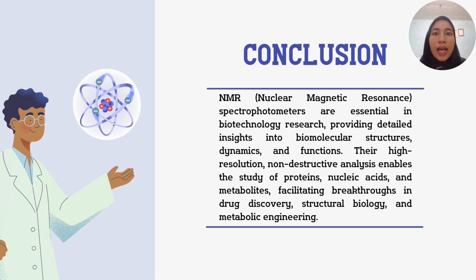In conclusion, NMR, which is nuclear magnetic resonance spectrophotometers, are essential in biotechnology research, providing detailed insights into biomolecular structures, dynamics, and functions. Their high resolution, non-destructive analysis enables the study of proteins, nucleic acids, and metabolites, facilitating breakthroughs in drug discovery, structural biology, and metabolic engineering.